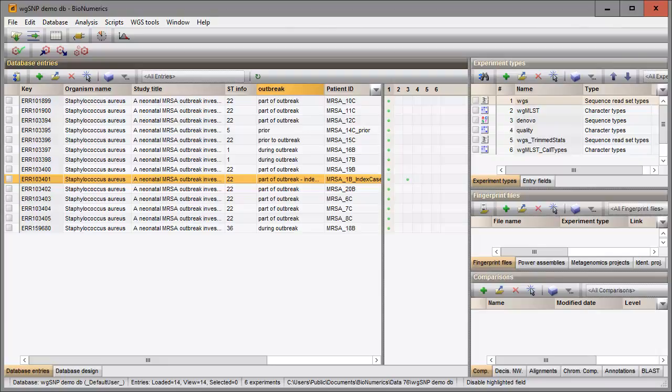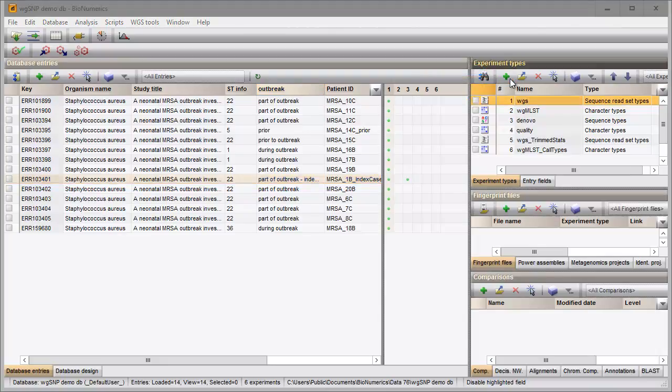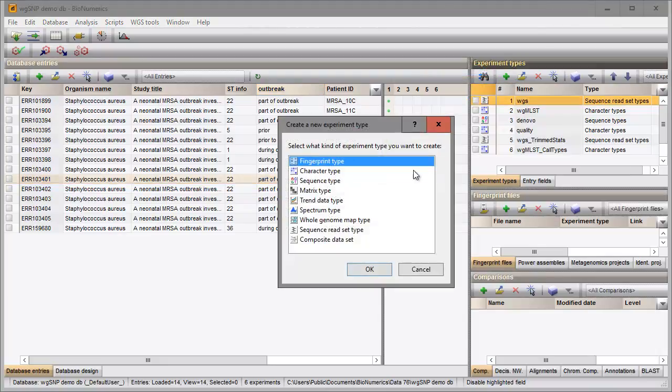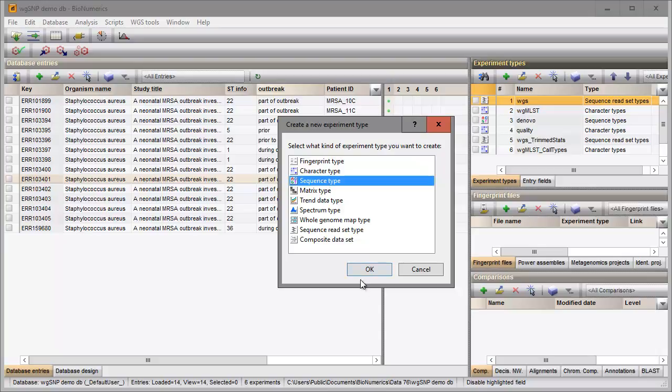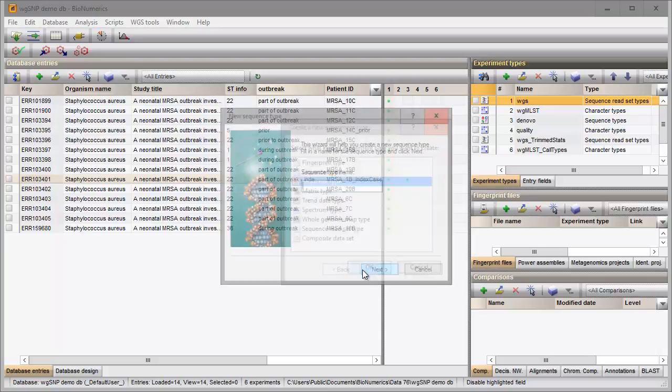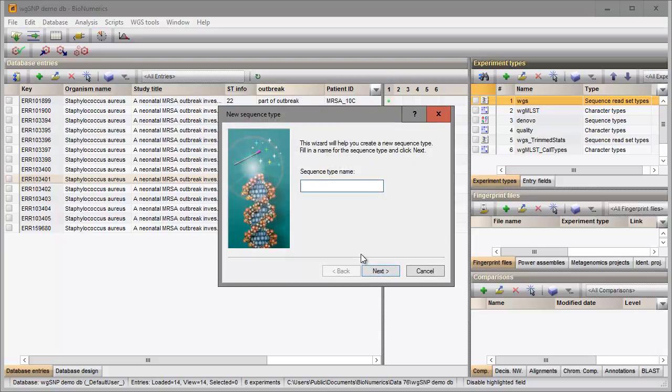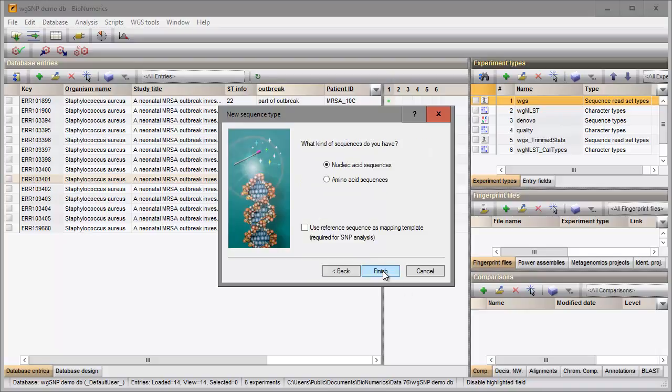First I need to create a new sequence type experiment. To create a new experiment I click on the green plus icon in the toolbar of the sequence types panel and I choose the sequence type option from the list. I specify a name and I check the reference sequence option in the last step.